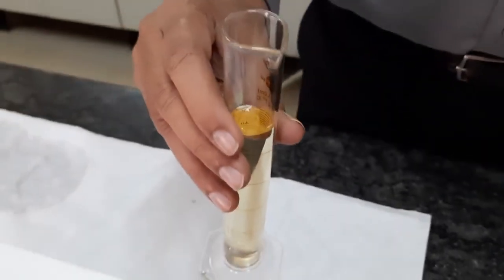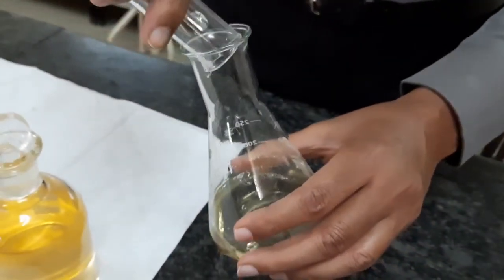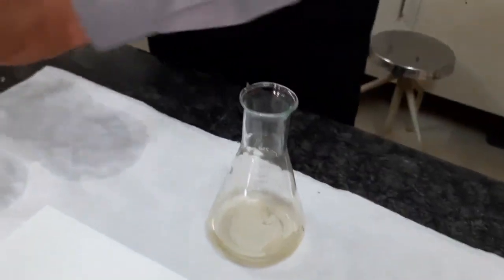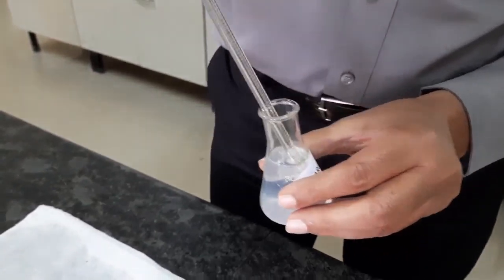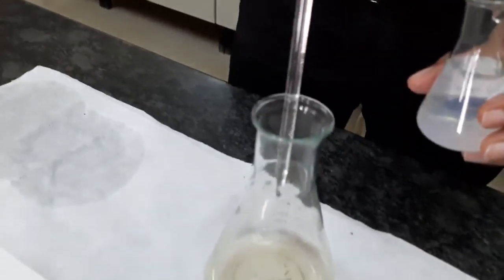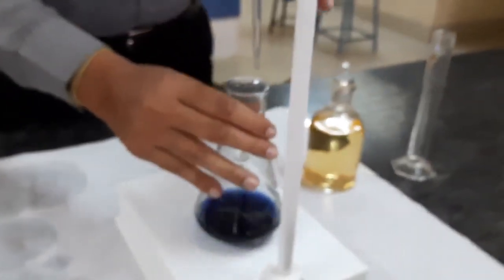50 ml of the sample is taken from the BOD bottle and added to the conical flask. Then add 1 ml of starch, because with starch you don't have any problem, you can mouth pipette it. The solution has become blue. Now we'll titrate it against sodium thiosulfate. The end point is blue to colorless.